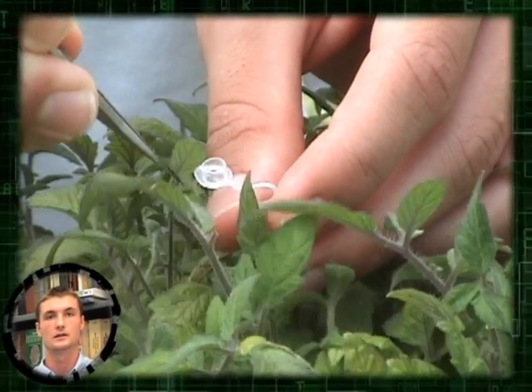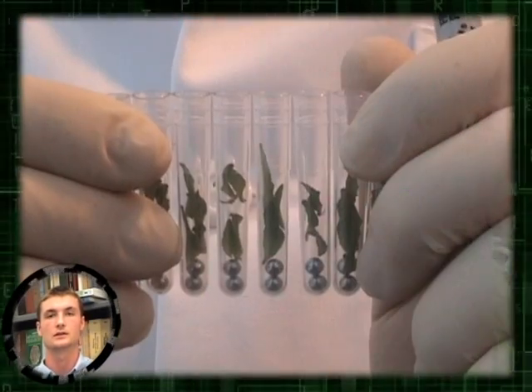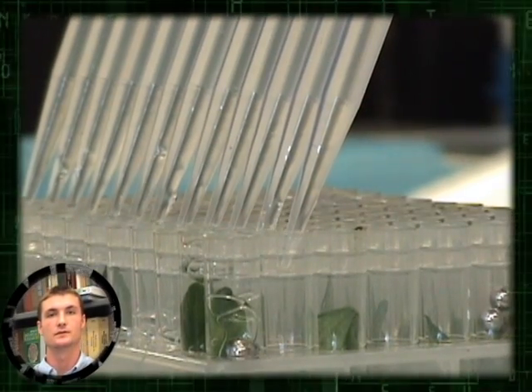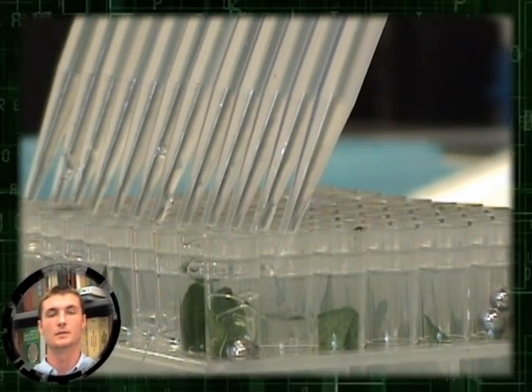We start by collecting leaf tissue from young plants. DNA extraction from tissue can be performed at different scales. The process is most efficient when performed in batches of 96.